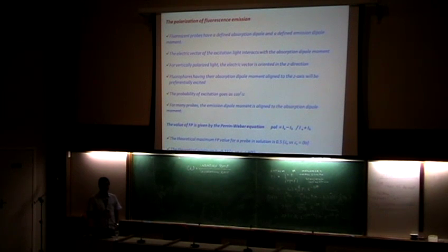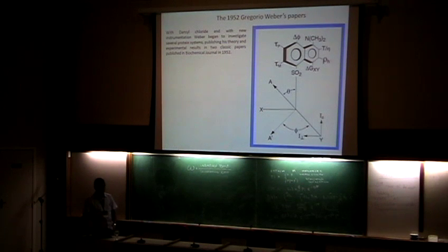And then during the lifetime of the excited state, you can look at the tumbling. You can measure, under steady state conditions, the polarization, just by measuring the intensities, parallel minus perpendicular over parallel plus perpendicular, and you get the amount of polarization. In principle, in solution, a probe can have a maximum polarization of 0.5. It varies sometimes because the excitation dipole is different from the emission dipole, so fluorescein is about 0.49, but tryptophan's maximum is about 0.4.